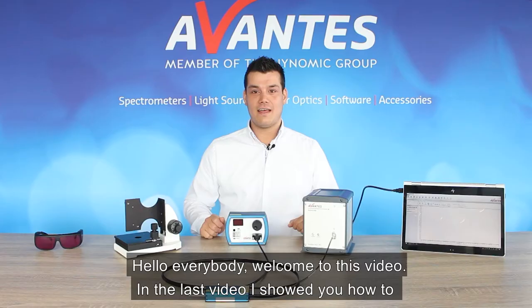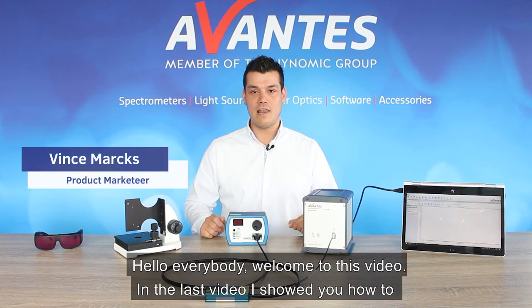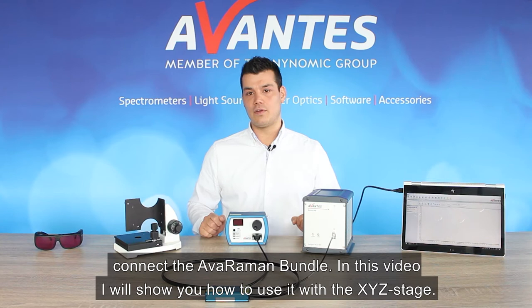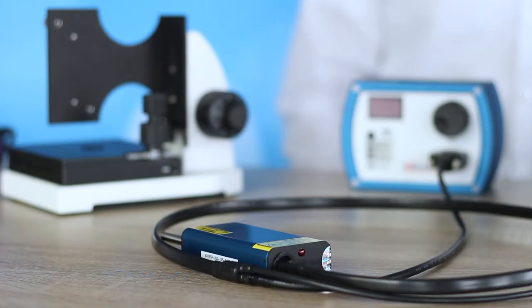Hello everybody, welcome to this video. The last video showed you how to connect the AvaRaman Bundle. In this video I'm going to show you how to use it with the XYZ stage.